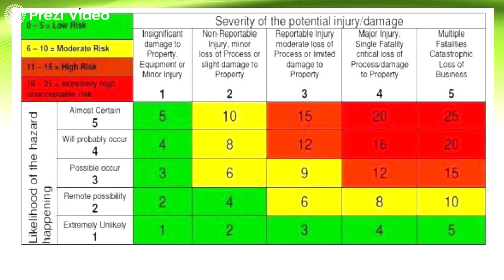So, ito yung ginagawa natin na process on how are you going to grade what is the likelihood of the hazard to happen. So, part pa rin to na risk assessment. So, kapag yung isang hazard, you're able to grade that as 25, delikado yun. Kasi possible na yung facility na pinagtatrabahuhan mo, very risky, high risk sa buhay. So, possible na mamatay ka. 'Di ba? Kasi meron ka multiple fatalities dyan right? So, usually, iniiwasan natin to. Iniiwasan natin na mangyari yung mga ganong klaseng occurrence.